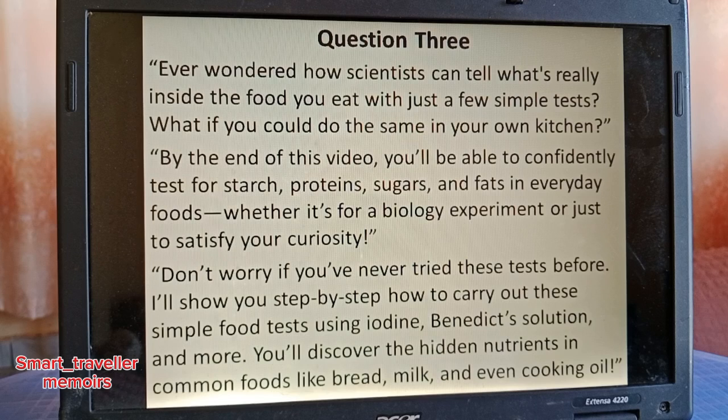So we are now in question 3, and we ask ourselves this. Have you ever wondered how scientists can tell what's really inside the food you eat with just a few simple tests? What if you could do the same in your own kitchen? By the end of this section of the video, you will be able to confidently test for starch, proteins, sugars, and fats in everyday foods, whether it is for a biology experiment or just to satisfy your curiosity.